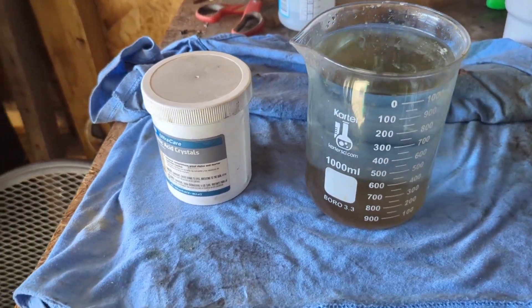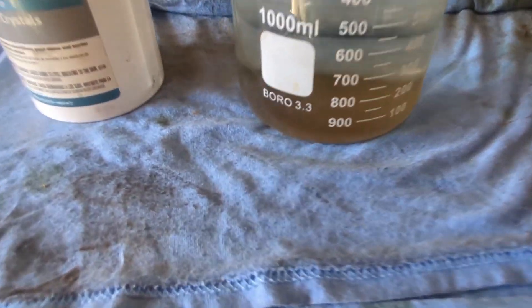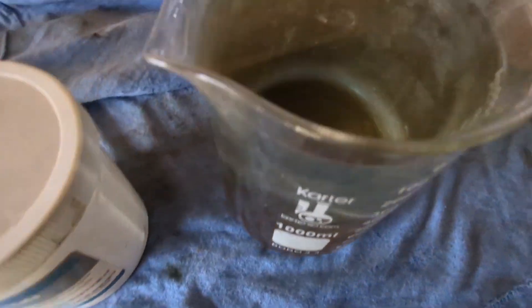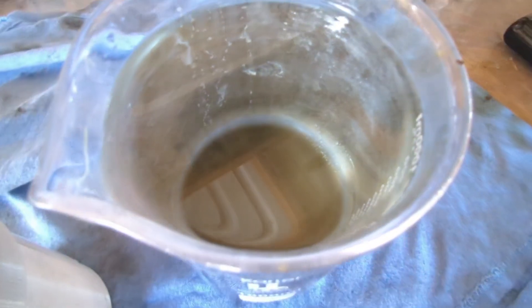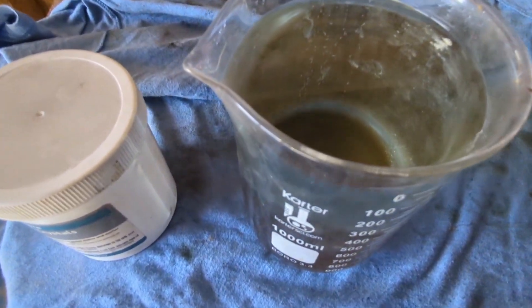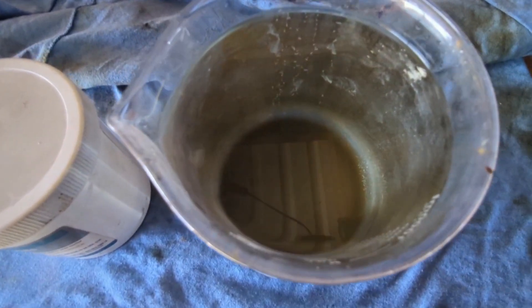So here we are the next day. Our gold has settled out. It's a nice brown color, not black. There is some white precipitant in there, but we'll go ahead and siphon off this liquid.